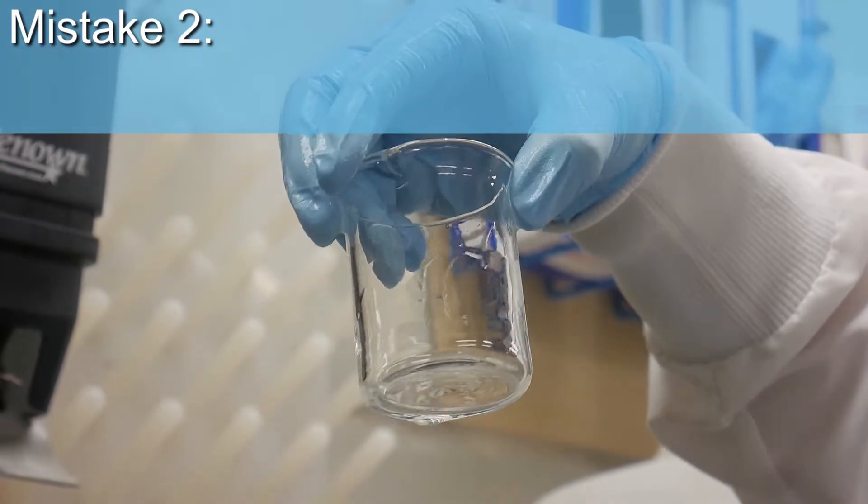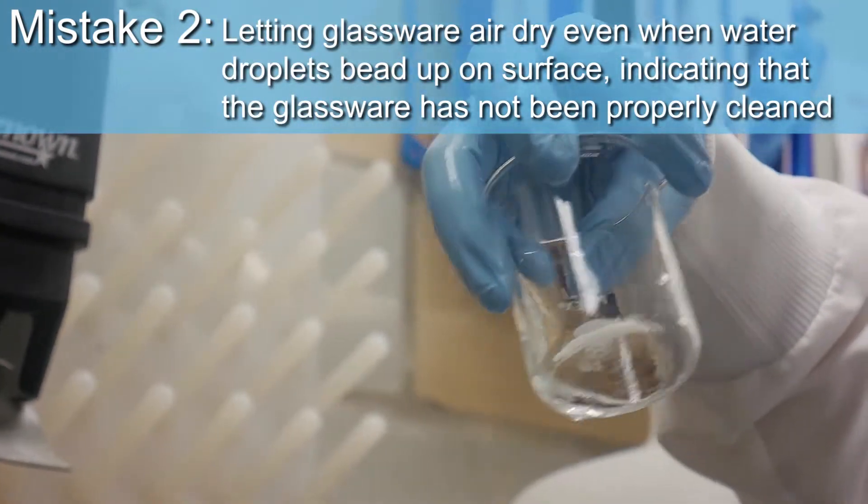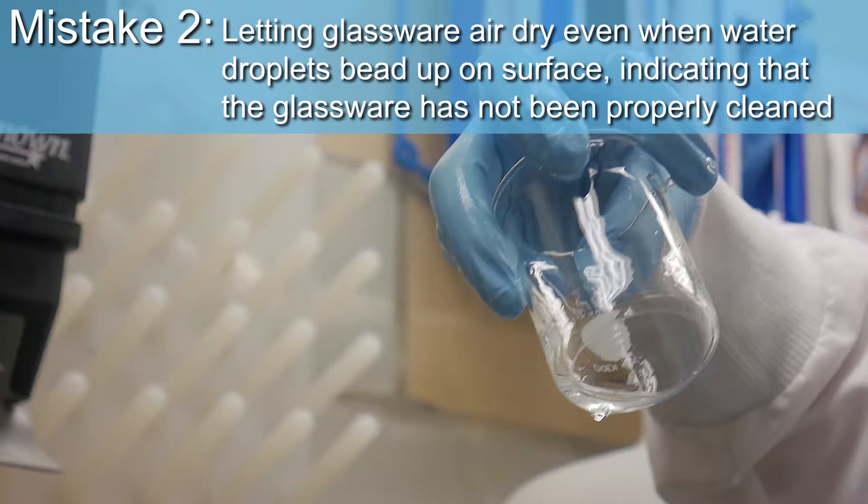Mistake 2: letting glassware air dry even when water droplets bead up on the surface, indicating that the glassware has not been properly cleaned.